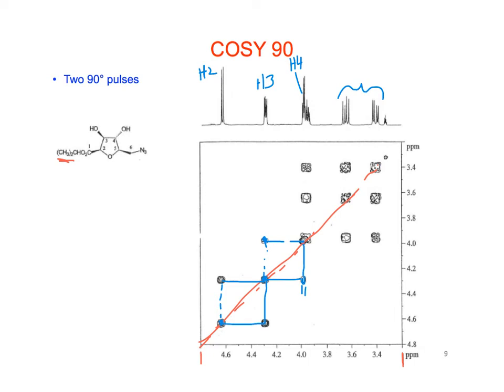So when you run into a difficult spot like that, it's okay to just kind of abandon it. You're going to always have different pieces, right? Just because we can have different spin systems within the molecule, not all of those spin systems are going to couple with each other. Ideally, a proton spin system is going to be one that has protons on adjacent atoms usually, and then we might have an oxygen or a quaternary carbon that blocks our proton spin system. But if we can construct the different proton spin systems, then we'll go to the heteronuclear experiments to bridge those spin systems together.